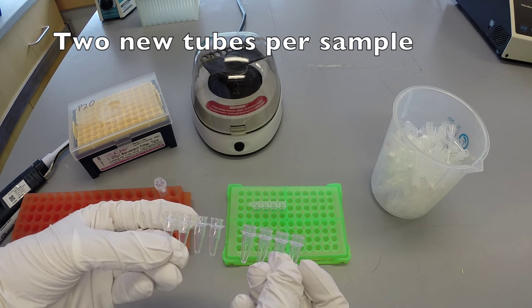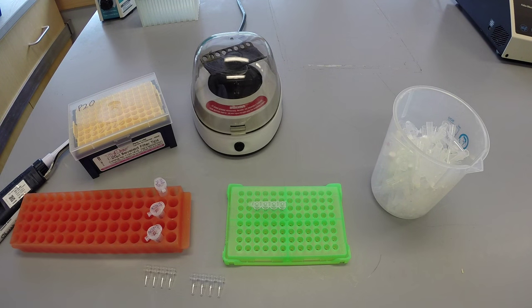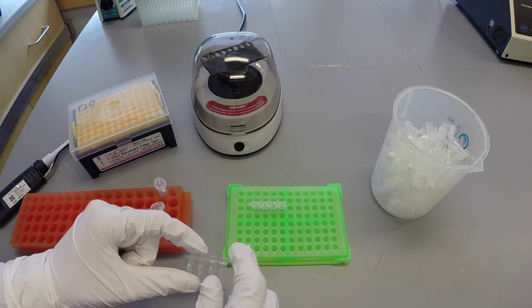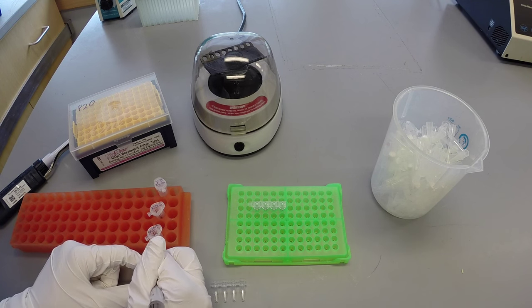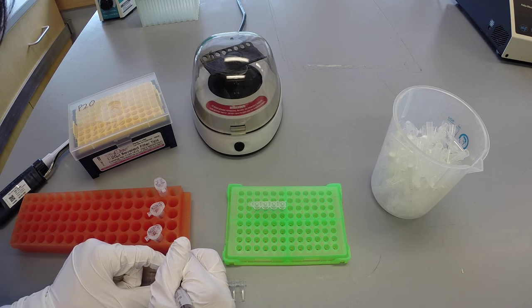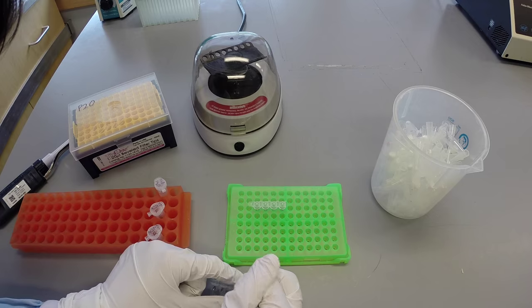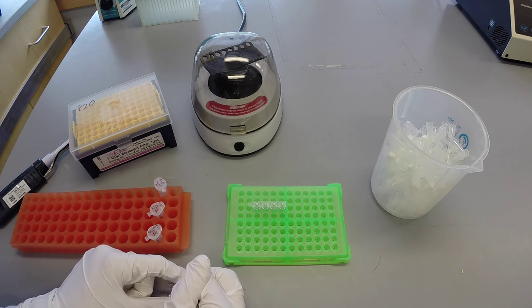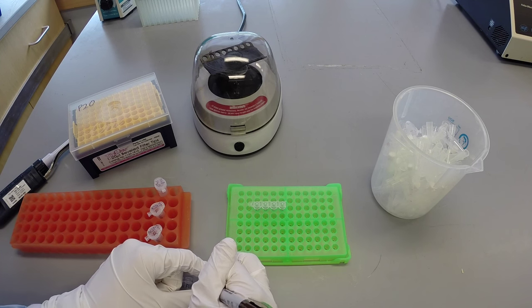It is critically important to obtain 2 new tubes per DNA sample, as the digested samples will be split between a forward sequencing reaction and a reverse sequencing reaction. In this example, the first 4 tubes will contain the forward reaction for the 4 digested samples, and the second set of 4 tubes will contain the reverse reaction for the 4 digested samples. The sample number is written on the front of the tubes, and the sequencing direction, F or R, is written on the back of the tubes.